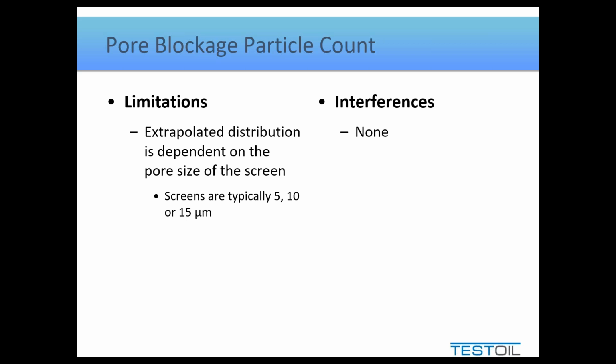So pore block really, just like optical particle counting, doesn't actually tell us the true size of the particles in any one particular dimension, but here's why it's the preferred method. It has no interferences.